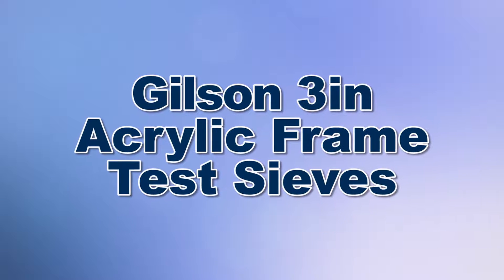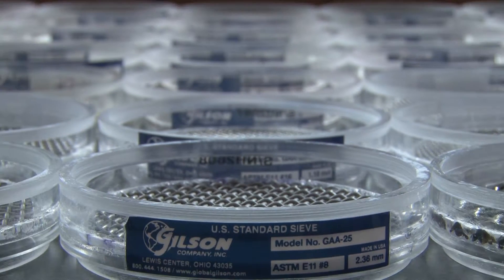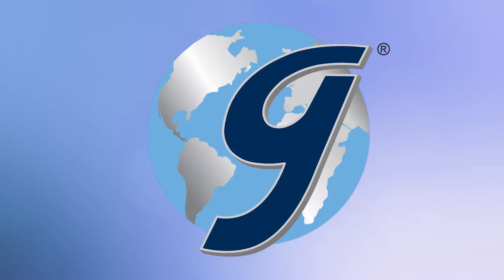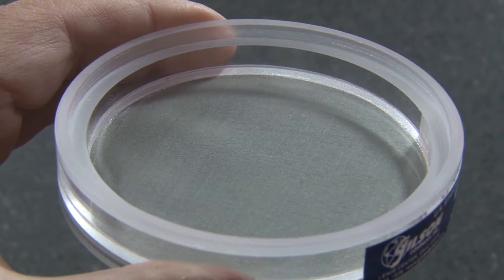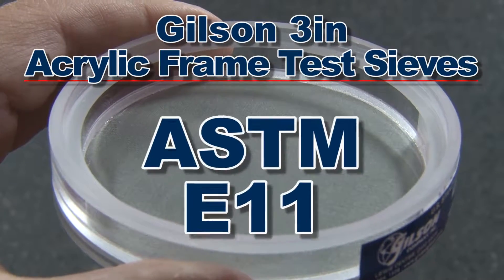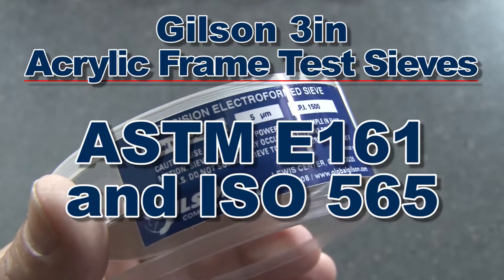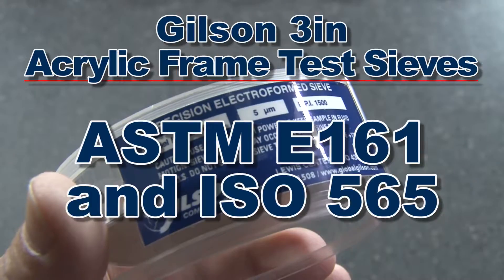When you need an alternative to metal frame sieves for your small sample dry powdered separations, then Gilson is your best choice. The Gilson 3 inch acrylic frame test sieves are available in either ASTM E11 woven wire cloth or ASTM E161 and ISO 565 precision electroform mesh.